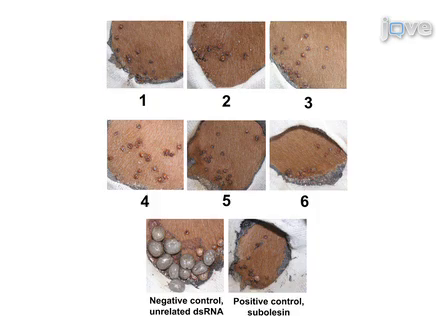A typical phenotype after gene knockdown in ticks is shown here, where a panel of ticks were injected with pools of double-stranded RNA that were used to screen for tick-protective antigens. In ticks that are examined by light microscopy, cellular degeneration in tick tissues may be observed. Phenotypic changes may also be accompanied by loss of function. For example, RNAi of subolesin results in sterile males that cannot mate successfully with the females.